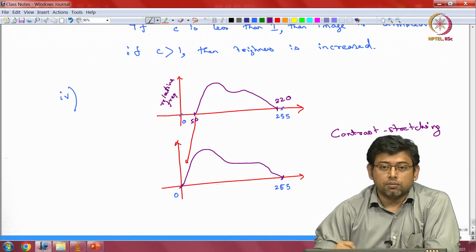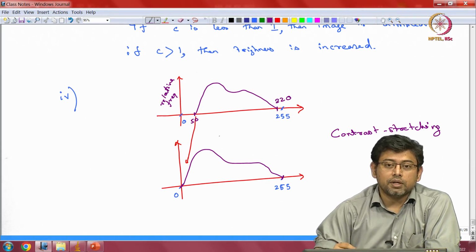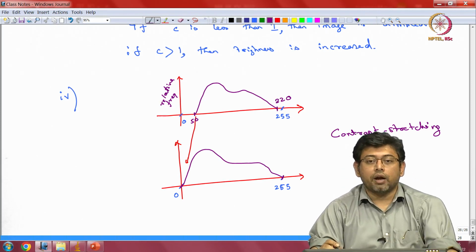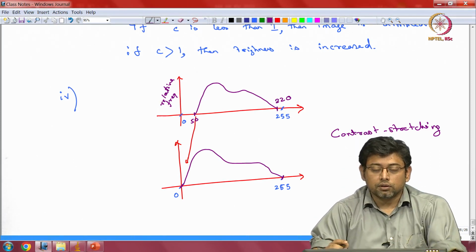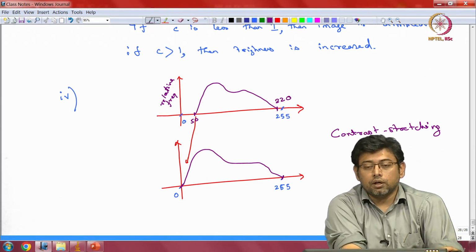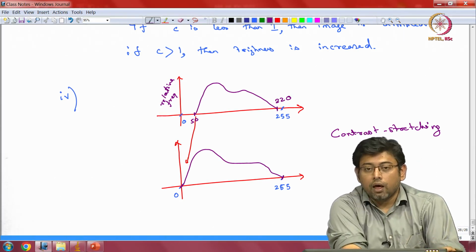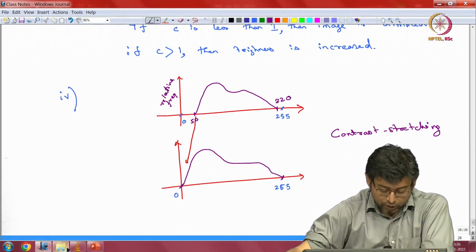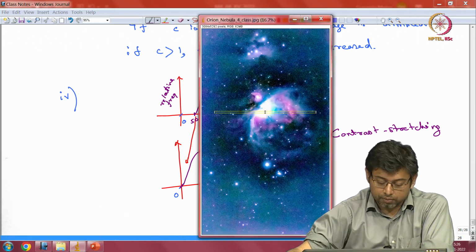The image at the bottom has a better contrast than the image at the top, and that is just done through managing the relative histogram, and that you can do by changing the transfer function. That is something that tools in many different software have. Now ImageJ also allows you to do that, and let's take a look at how you might want to do something of that sort.